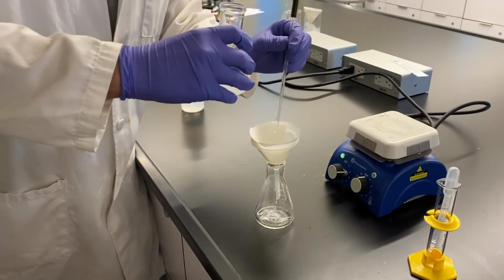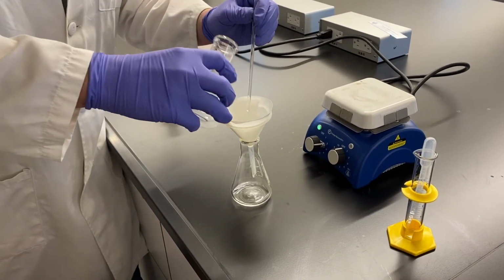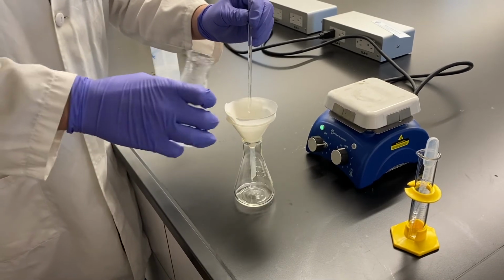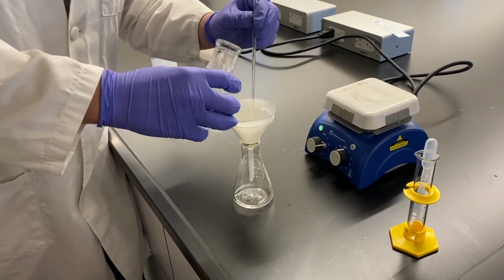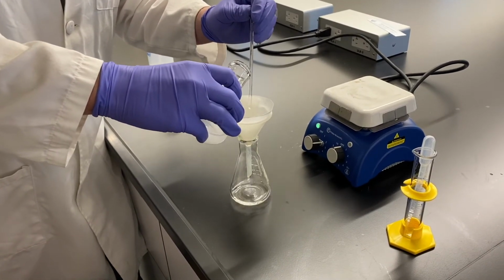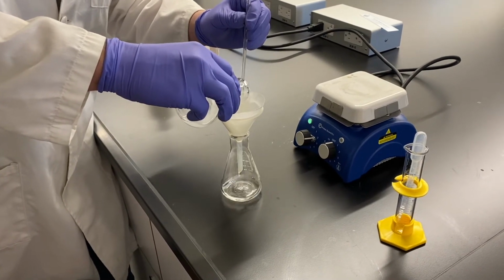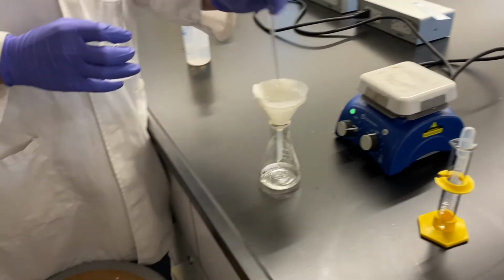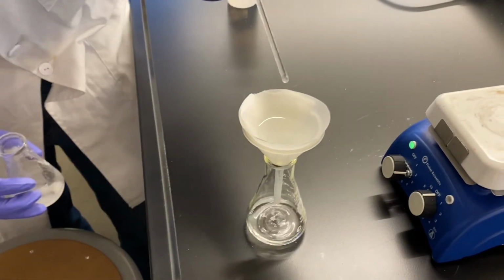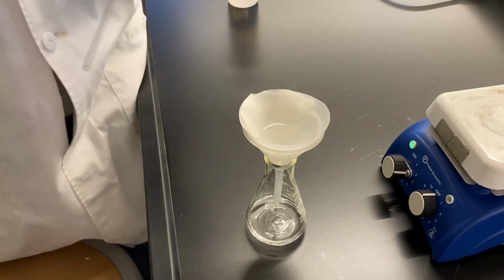And you can see there's that swirling around to get a nice slurry. And then we'll decant it in. You can see the precipitate clumps at the bottom. You might be able to see it a little bit while we're pouring. We'll have to rinse it with lots of water just to make sure we get all the precipitate out. Because while the precipitate doesn't dissolve in water, just imagine if you had rocks in a bucket, if you swirl the bucket, the rocks will move too.